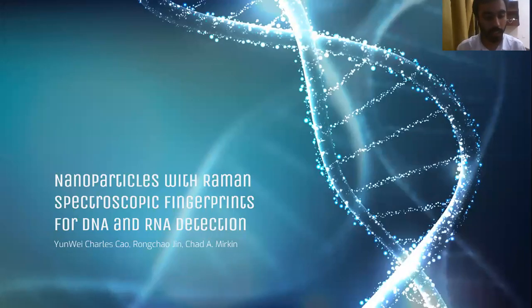Assalamu alaikum everyone. My name is Haider Khan and the paper that I am reviewing for my third KPR of this semester is nanoparticles with Raman spectroscopic fingerprints for DNA and RNA detection. Really, the technique that the paper describes is pretty much summed up in the title itself. So let's go forward.